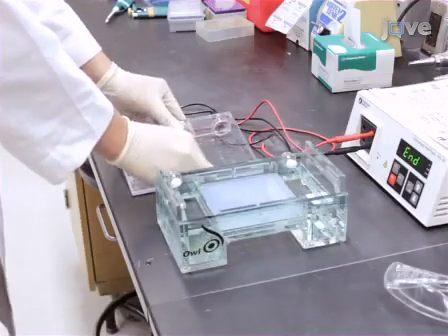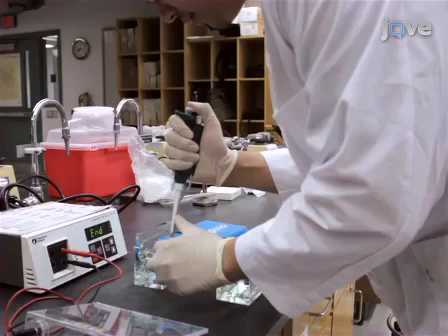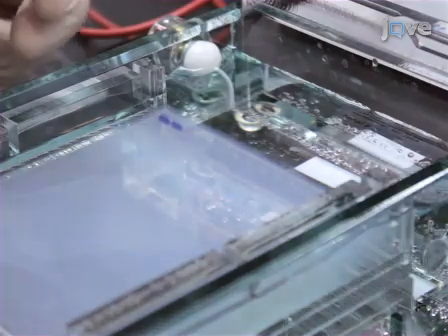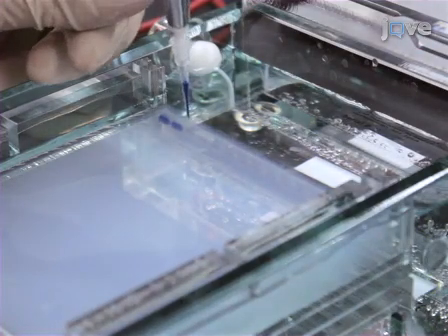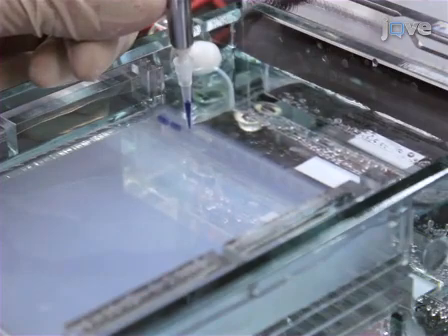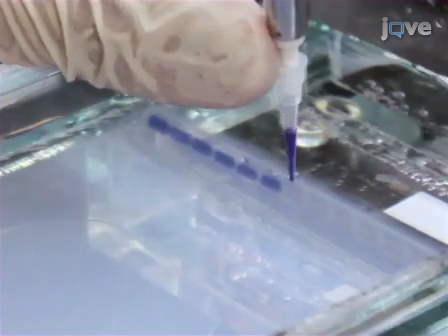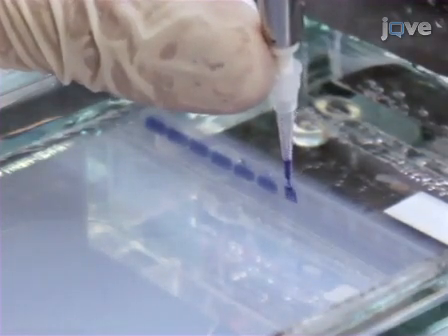Remove the lid of the gel box. Slowly and carefully load the DNA samples into the gel. The loading dye in the sample allows the sample to sink into the gel and will help to track how far the sample has traveled. A DNA size marker should always be loaded along with the experimental samples.